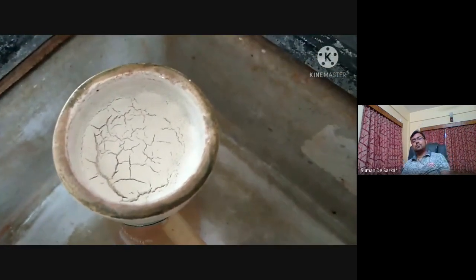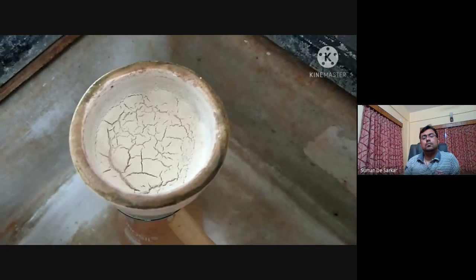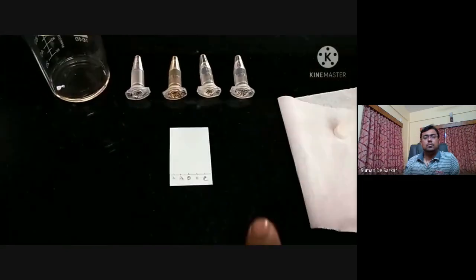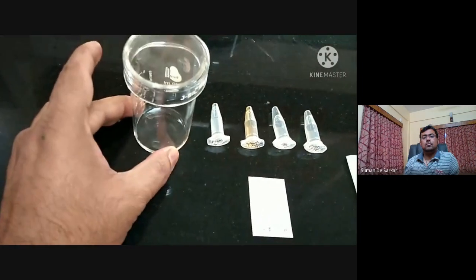All right, so we'll just wait for a few more minutes so that all the water goes out from here, then go to thin layer chromatography or TLC. For that, we need this TLC plate and the TLC chamber here with some solution here. You can see here, which is the eluent here.